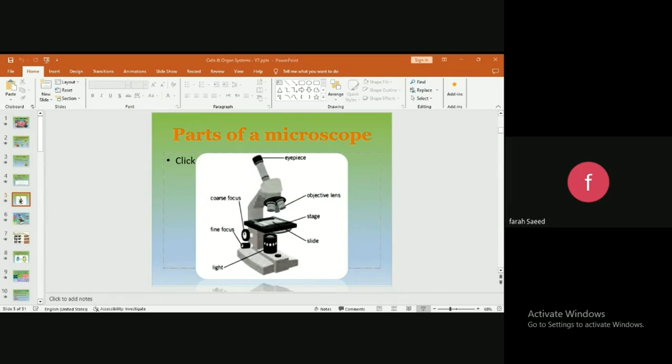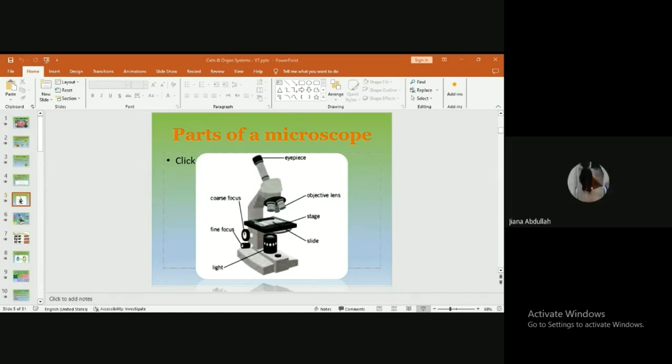Next, Jiana, do you see this black part? This is called the stage. Do you know the job of the stage, what it's used for? I think—I'm not sure—but I think you put the thing you're trying to see on the stage. Exactly! You put the thing you're trying to see on the stage.